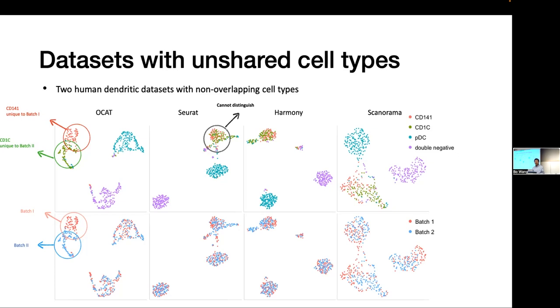Which Seurat integration method is it? Is it CCA? This is CCA, yeah. This is the original Seurat.